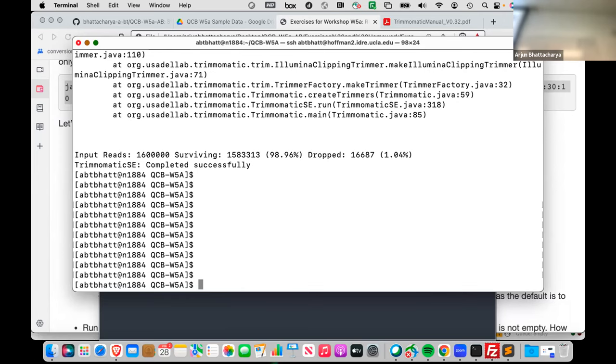So that's the file. The assumption whenever you're calling a file name or an executable is that you're giving it the full path starting from where you are. For you, you're starting here, but you have to get there, and there's no way to go from here to there easily. So either you start here and then point down to the contents, or you say the full path starts from /u, home, and then you follow the whole branch down to the Trimmomatic object.